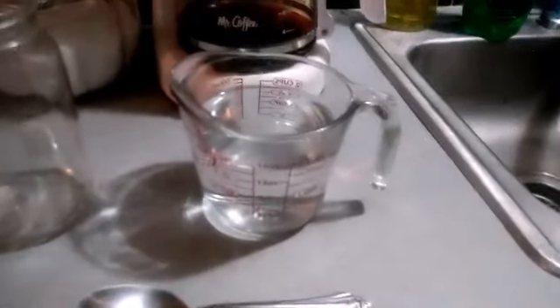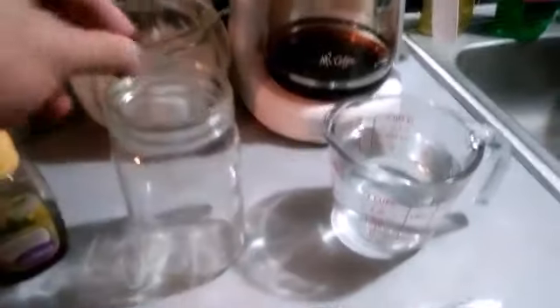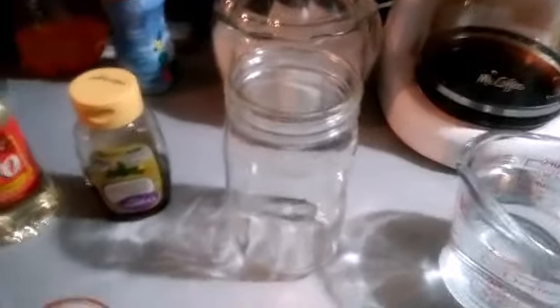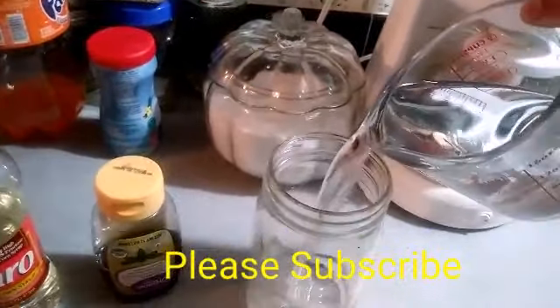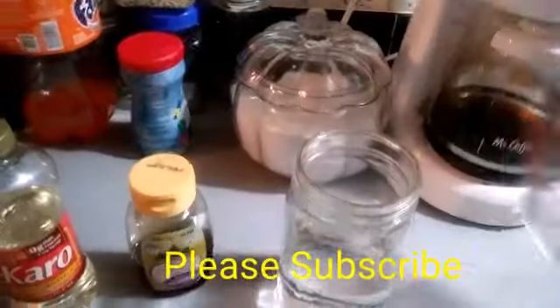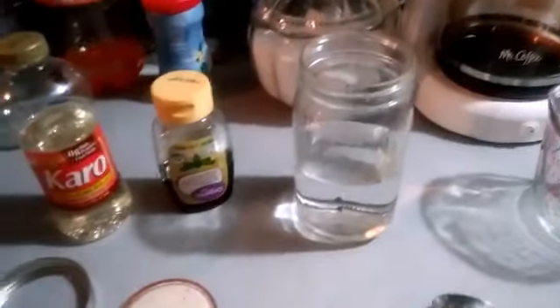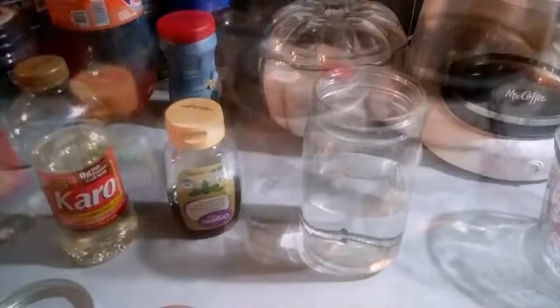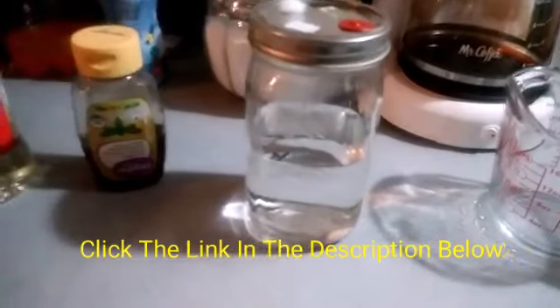And all you need is 1 tablespoon, 2 cups of hot water, and a couple of drywall screws. Throw your drywall screws in there. Pour your 2 cups of water in there. And now I'm going to put a tablespoon of Karo light syrup in there. Alright, there we go. I got my 1 tablespoon of Karo corn syrup in there.